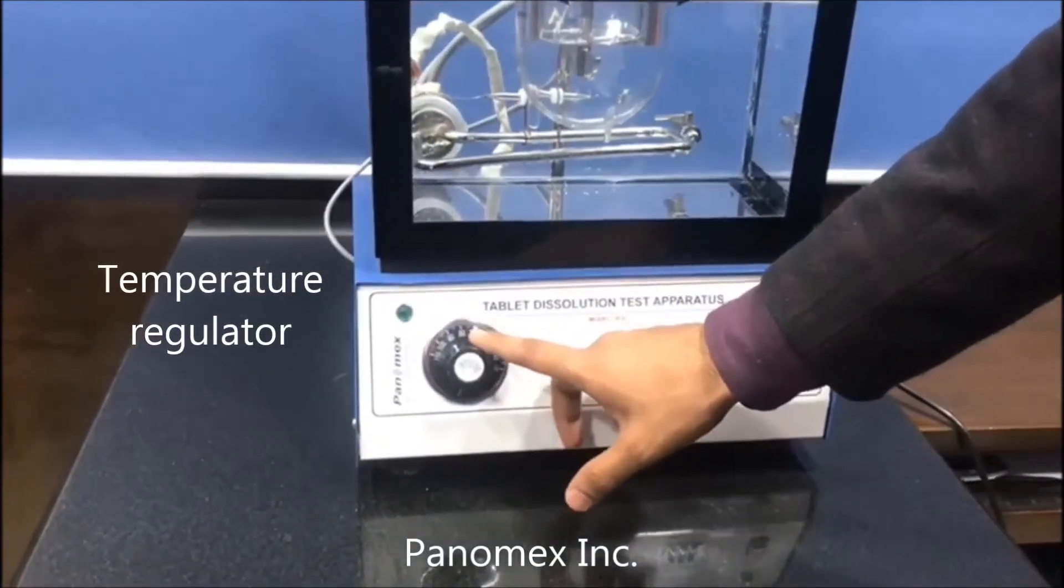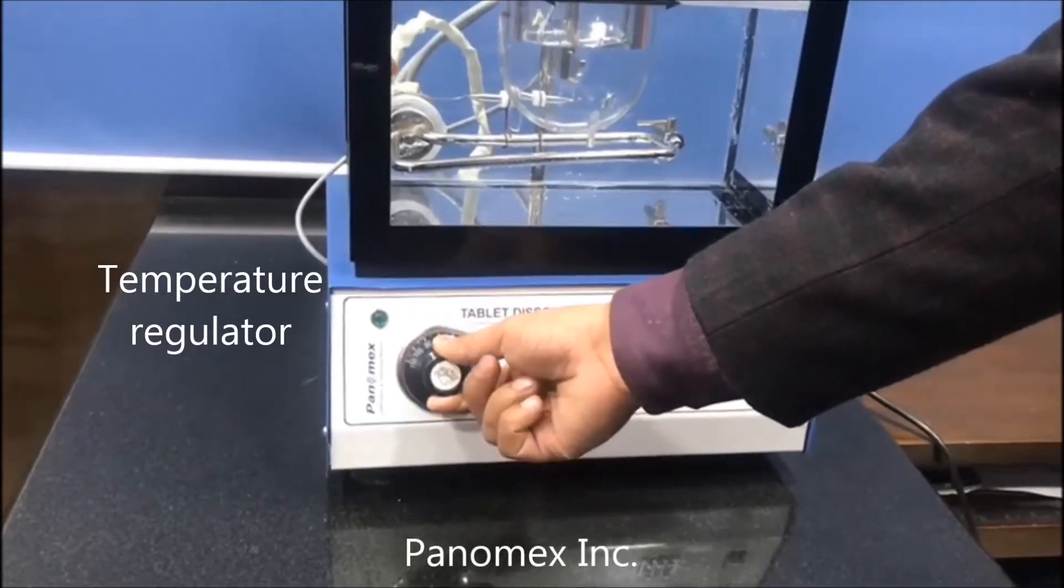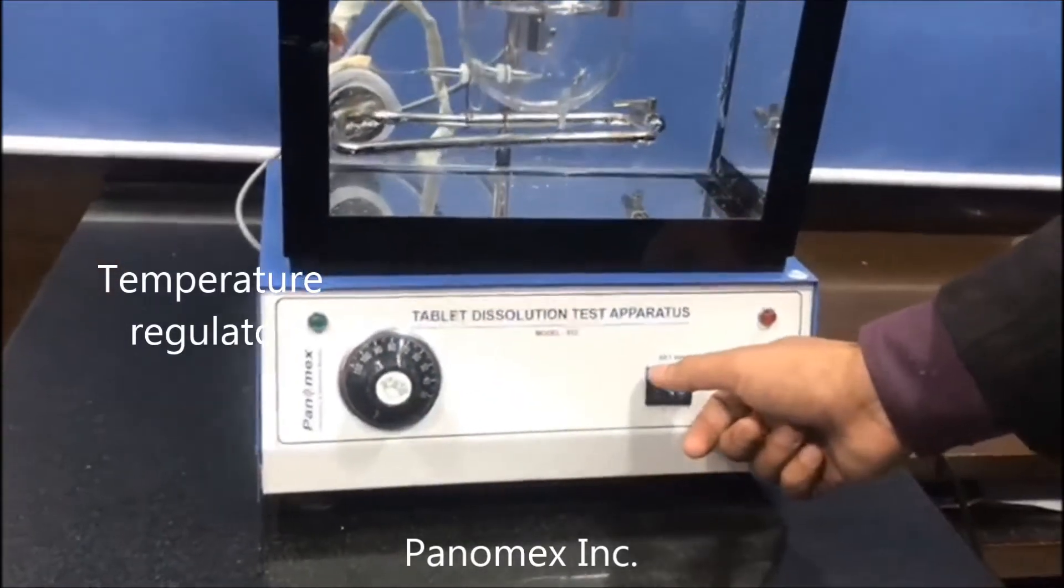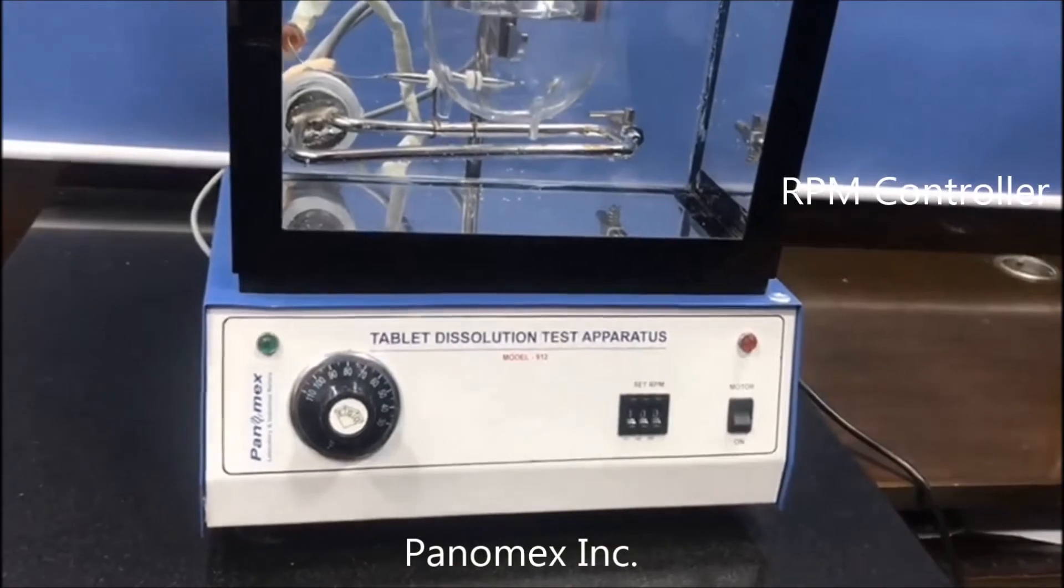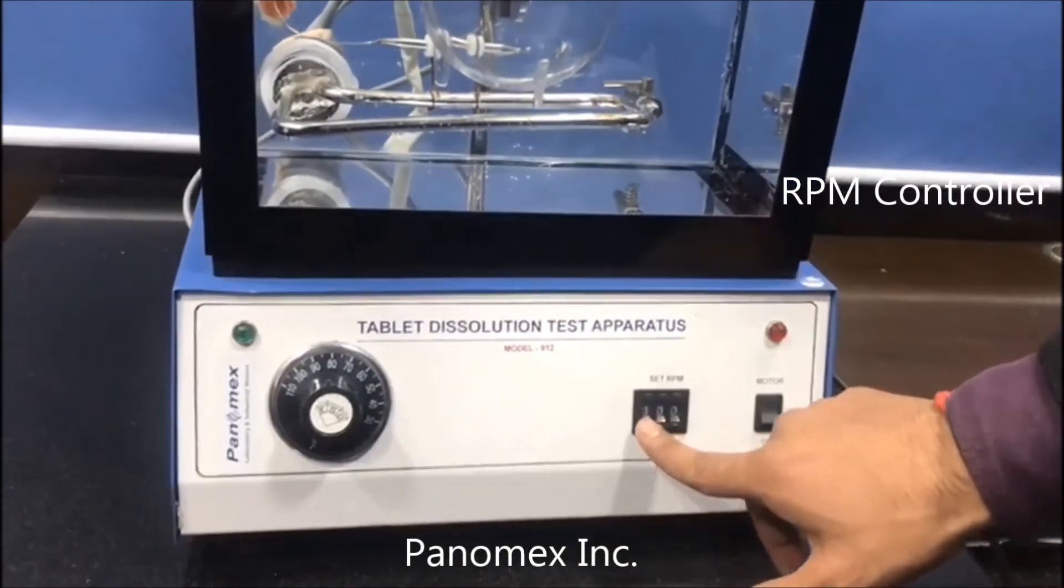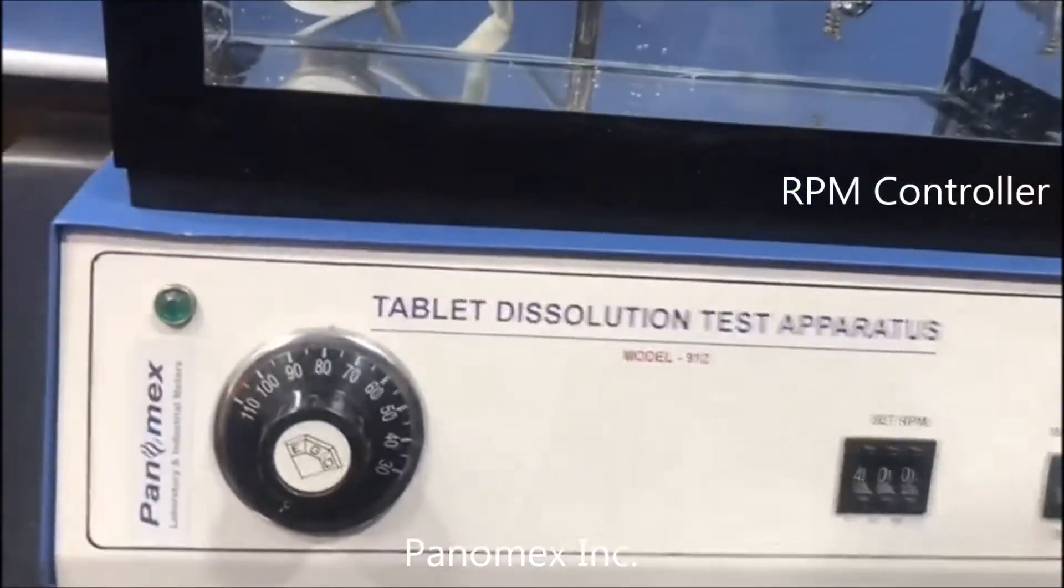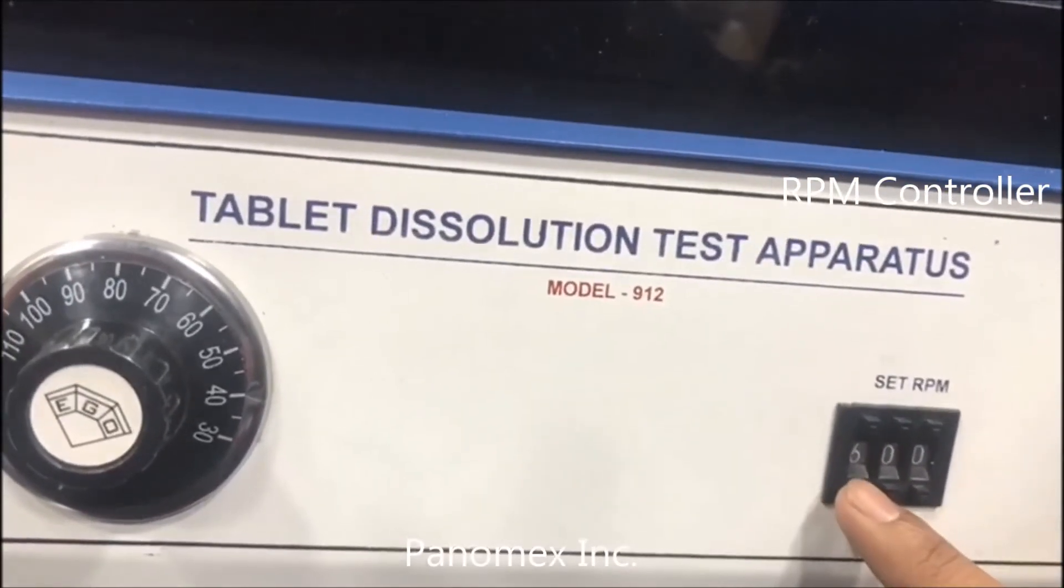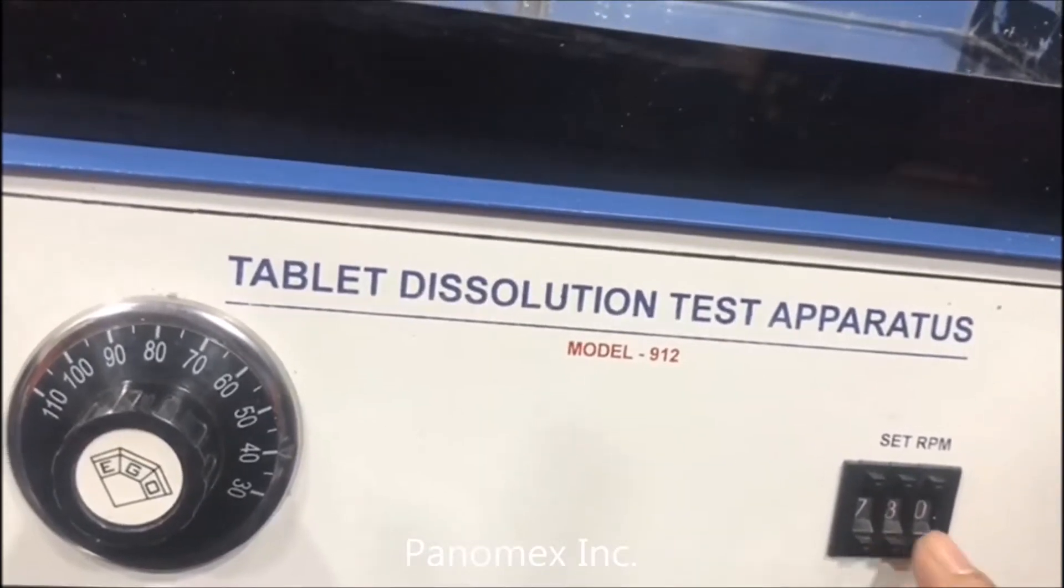This is the temperature regulator. As you can see, you can move it like this as per your need and requirement. It's written here set RPM—revolutions per minute. You can see it is moving and increasing: five, six, seven. Same with this one and the other one.